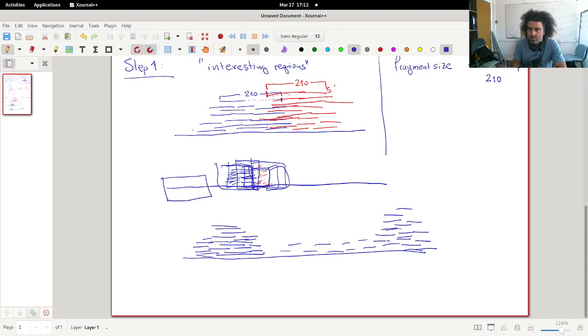Now we use a window approximately of this size, so we scan it. Let's say that this is the window. We identify the number of reads that are inside here. Let's say these are 30 reads, and then we move on one base pair to the right, so this is the next window. Count the reads, so nothing will be excluded here, but some new will be entered here. So let's say that this has 35 reads, and then we move one position.